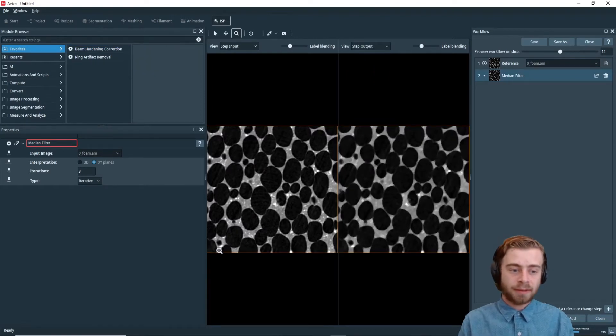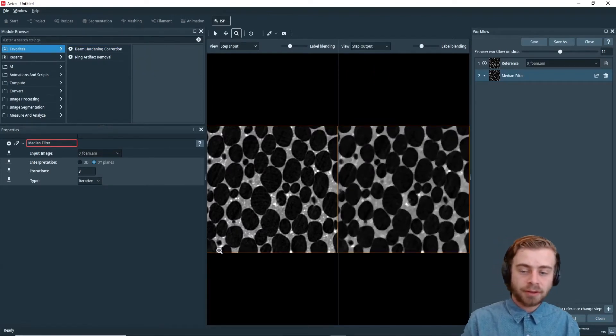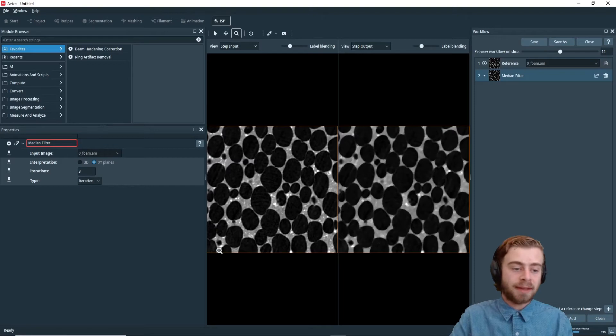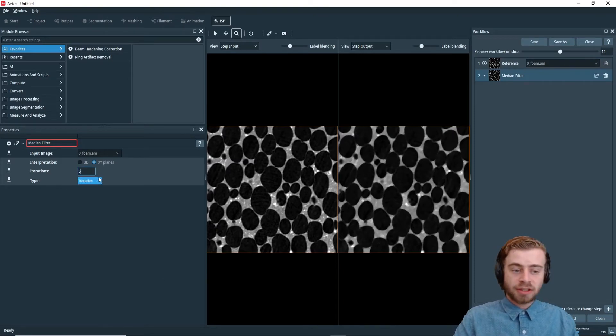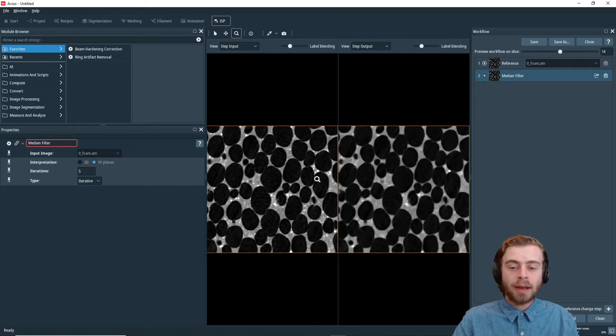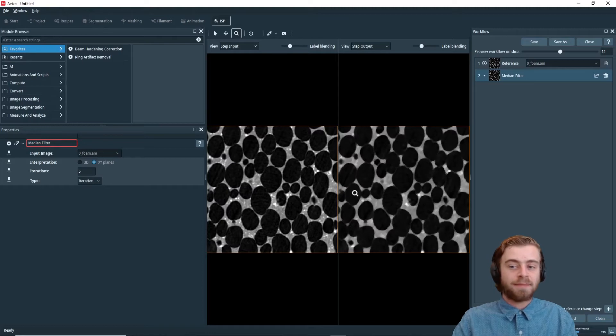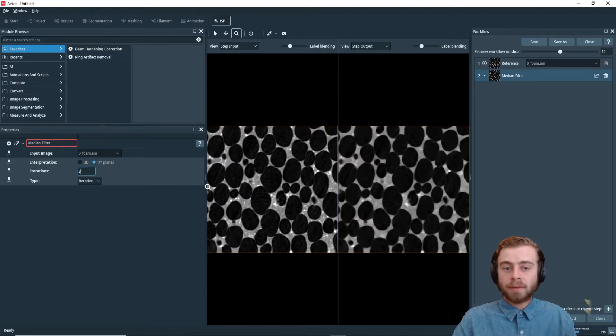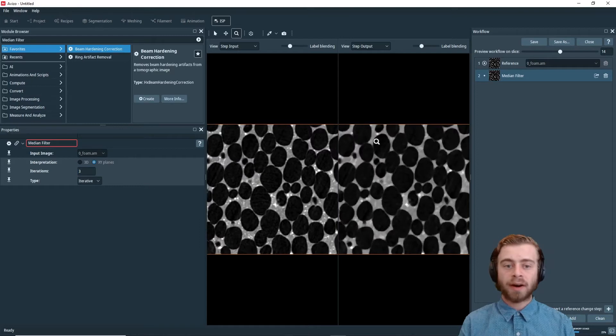So now that we have the median filter in, to change the different parameters of the median filter, you can do it really easily by just changing the iterations right here. So if we change it to five iterations, it only takes a second to recalculate because we're only processing it on one slice instead of many slices. But for our purposes, we're just going to keep it at three.